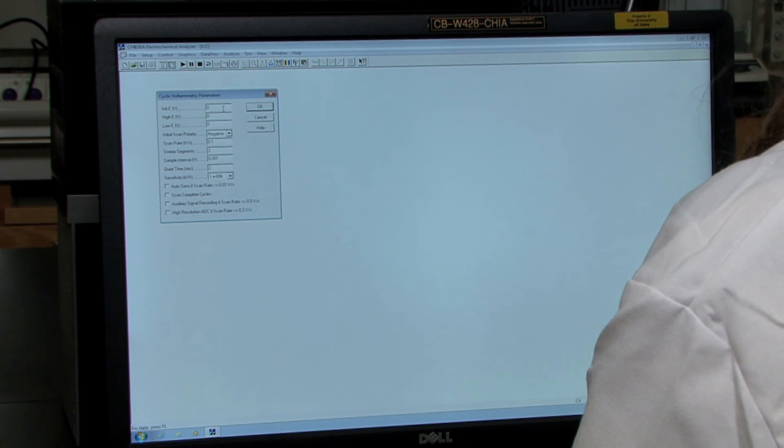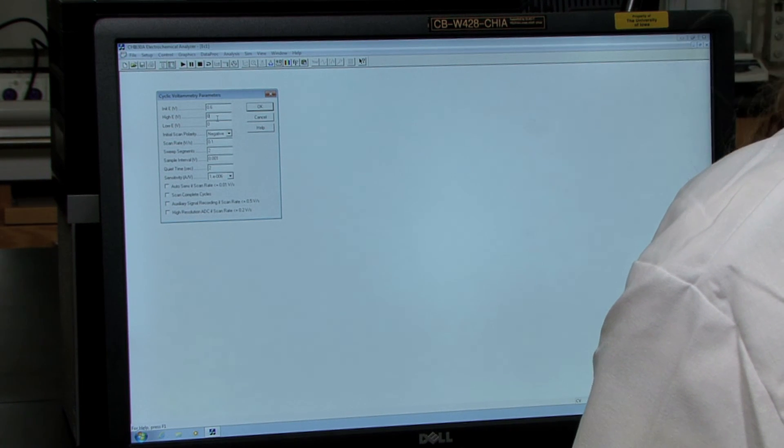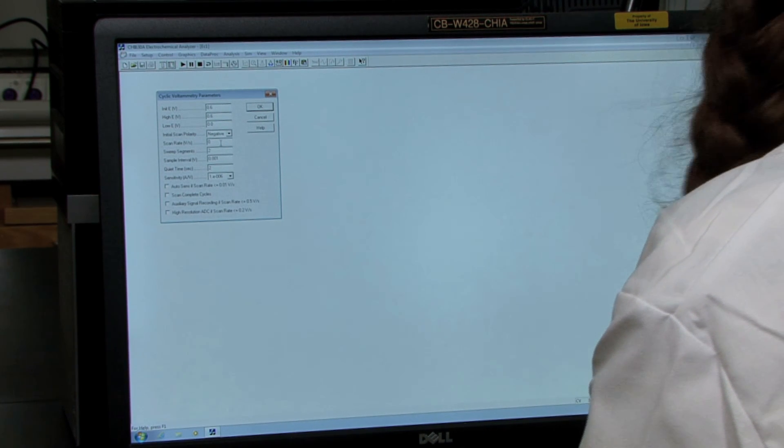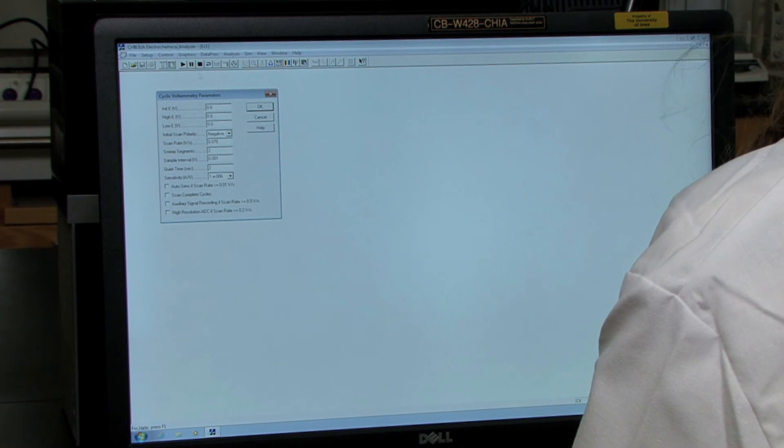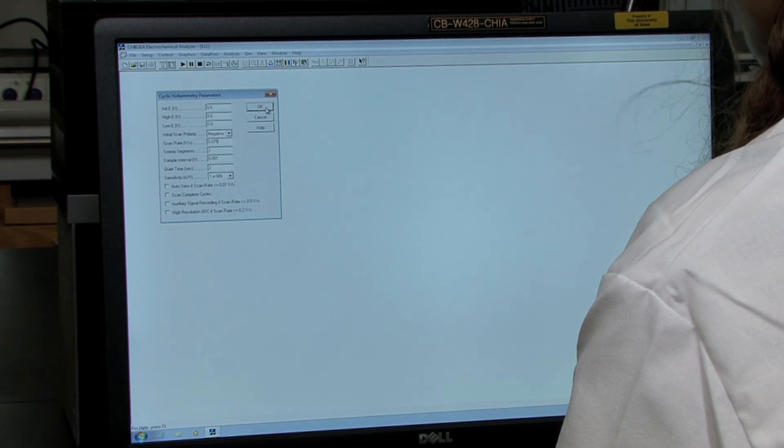The initial voltage you'll be using is 0.6 volts, and your high voltage is the same, 0.6. Low voltage is 0. We're scanning in the negative direction. The scan rate we'll be using is 75 millivolts. You can leave the rest of the parameters set at default for now. If you encounter any problems or your CV isn't turning out right, you can get a TA and they can show you how to adjust these parameters. When you've set the parameters, hit OK.